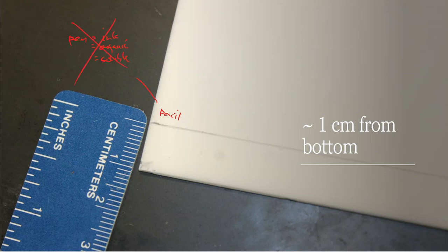So this is why we stay away from the pens, folks. We do not take pens into a TLC laboratory. They will look at me with shame and they will run me out of the lab. All right, so we always use pencil. And I do 1 centimeter up, and as you can tell, I have drawn that line 1 centimeter from the bottom all the way across, all right? This is going to represent my starting line, okay? This is where I'm going to start my spotting a little bit later on, but this is my starting line for all of my components.